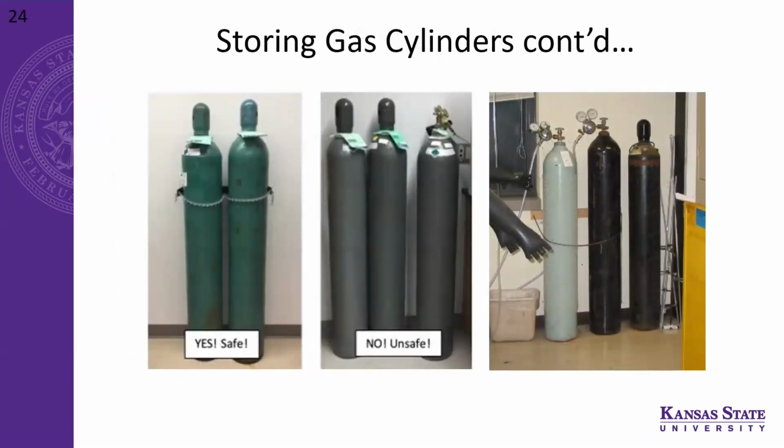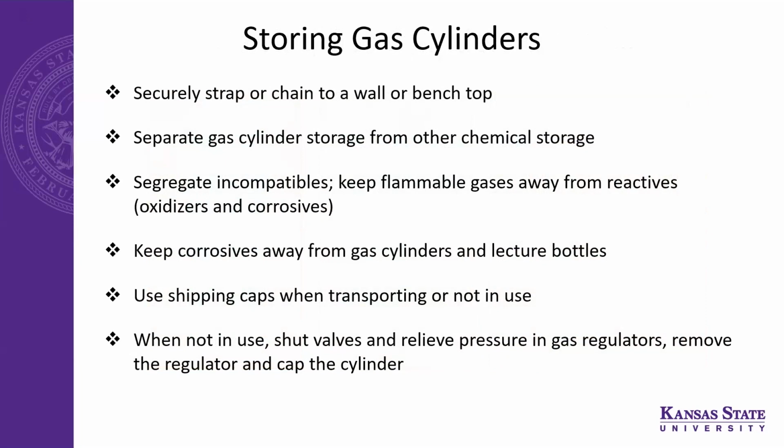Here also, one point I want to point out: the university probably doesn't have any regulations on this, maybe, I don't know. Where should these cylinders be, in the open space or in a safe? Protected from the rain, sunshine or snow, because I think that is a good idea. That's why last year we renovated the gas cylinder place in our physics department. But I don't know, EHS may have some rules on this.